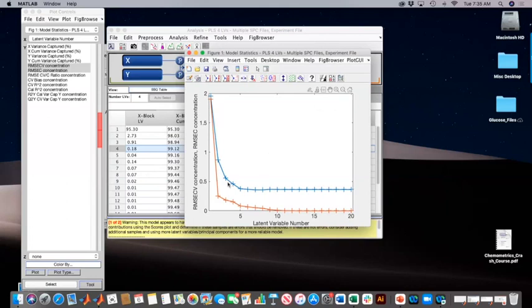For one thing, by the time we're two factors into this, my model is way overfit already because I've got an error that's close to 1, but my fit is down here around 0.2. So that doesn't look too good yet, but you've got to start somewhere. We do remember that we had some outliers in this data set, and so let's start by exploring it. So I'm going to just close that.